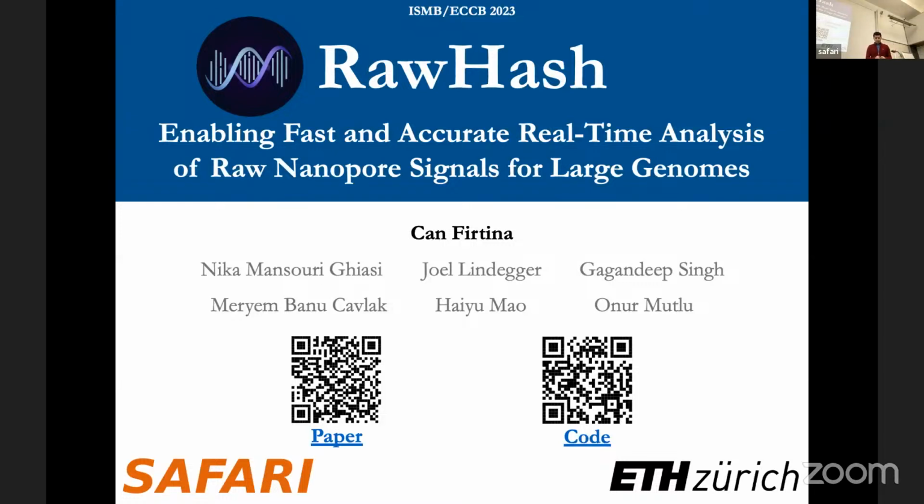Welcome again, everyone. Today we're going to present the paper entitled RawHash: enabling fast and accurate real-time analysis of raw nanopore signals for large genomes. This paper was presented at the ISMB ECCB conference last year in 2023 and published in the Bioinformatics journal as part of the proceedings.